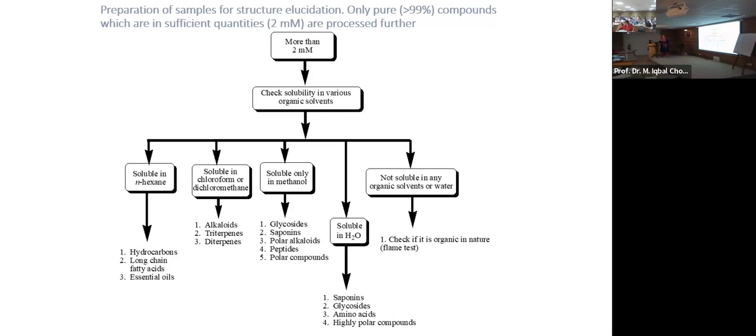Since you are giving the radio frequency, you may notice that whenever you go to the NMR lab, or if you have seen in your spectra, there are dummy scans. In dummy scans, the sample is receiving the radio frequency but nothing is recorded, because we want to stabilize the frequency.